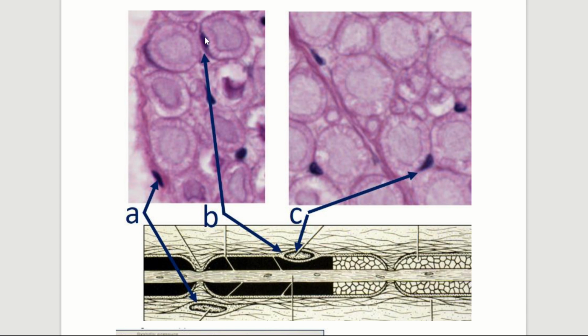And then B, so what this one's pointing to, it looks similar, and I know it looks similar, and that's what's tricky, but see how this one is hugging right around and connected to the myelin around this axon. So this is the axon, and see how this one is specifically hugging it, unlike this one, right? So yeah, this is a Schwann cell. These are both Schwann cells. And remember, Schwann cells are what are going to make the myelin around the axon. So this is the axon, this is the myelin, that's that protective sheath around it. So yeah, that's what that is.